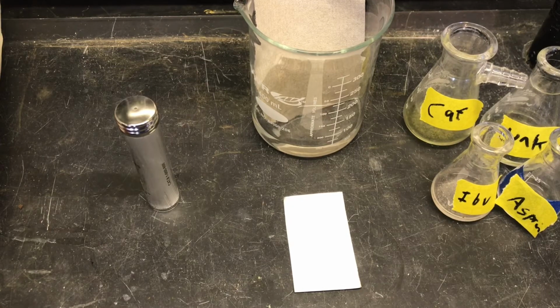These are all dissolved in methanol because that dissolves all of them and goes well with the experiment. I'm not going to get into too much detail about that since we don't have much time, but it's important to note that you want something that will dissolve all of your substances. And then for the eluent, ethyl acetate, again, dissolves all the substances.